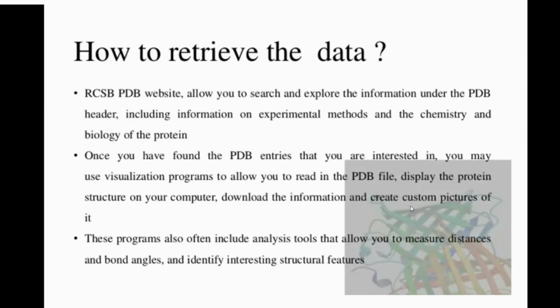You can create it in different types there. These programs also often include analysis tools that allow you to measure distance and bond angle and identify interesting structural features. There are various analysis tools by which you can measure the distance and the bond angle and also identify interesting structural features.